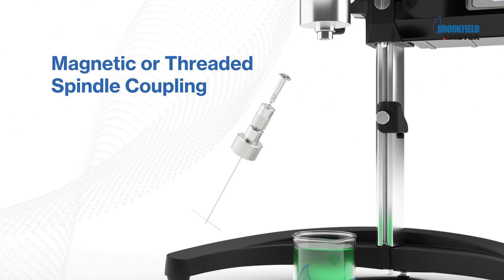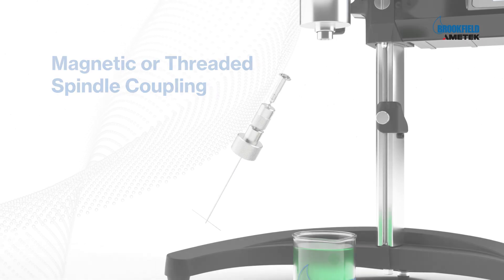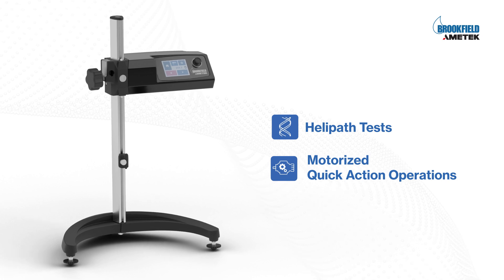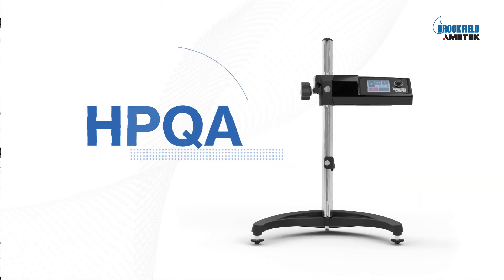Available with magnetic or threaded coupling options. Perform both helipath tests and motorized quick action operations with one solution. The modern choice — HPQA.